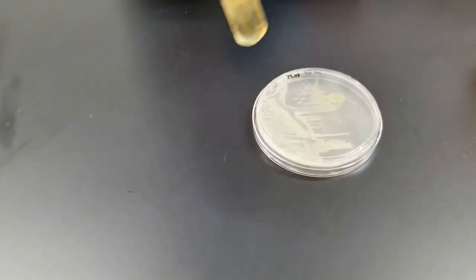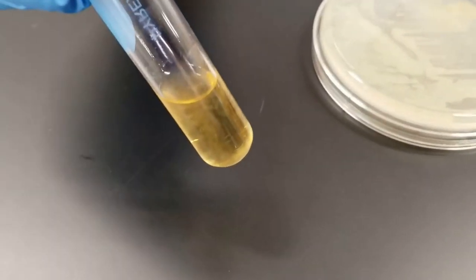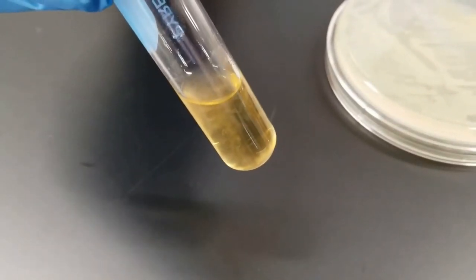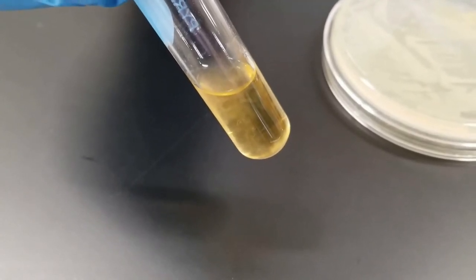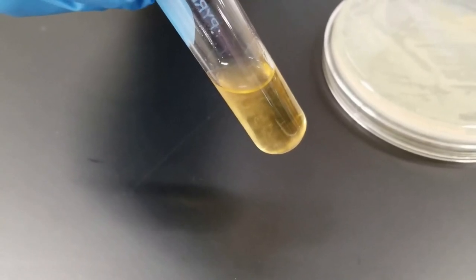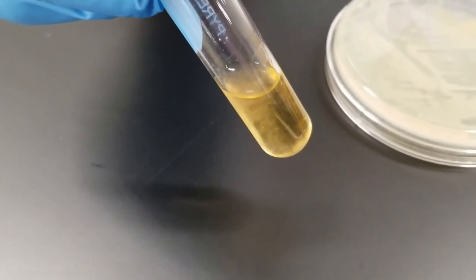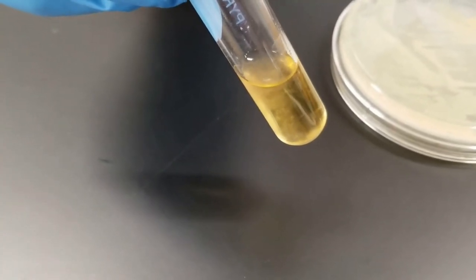Now the other tube that we inoculated was the thioglycollate. This will give us an indication as to the oxygen requirements on here. We just did a stab down and just down and up. You'll notice that there's growth along the stab line. But most of the growth is at the top portion of the tube. That is telling you some information about the oxygen requirements.